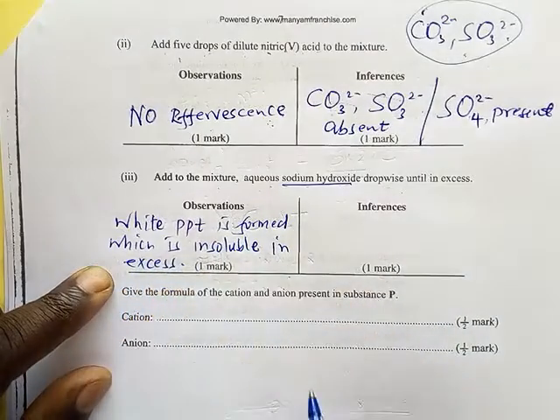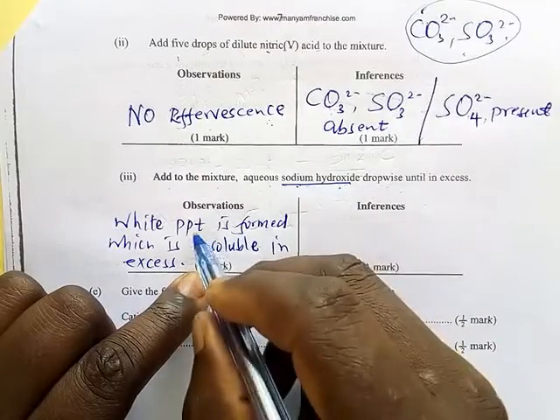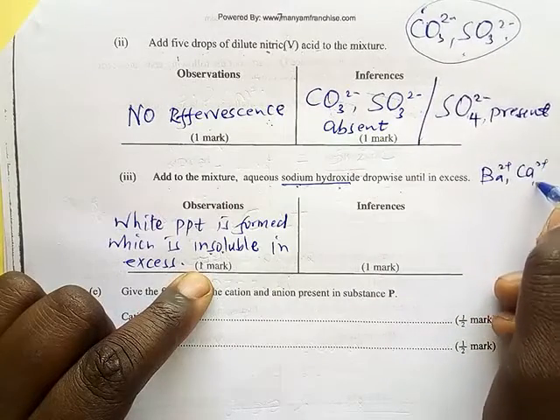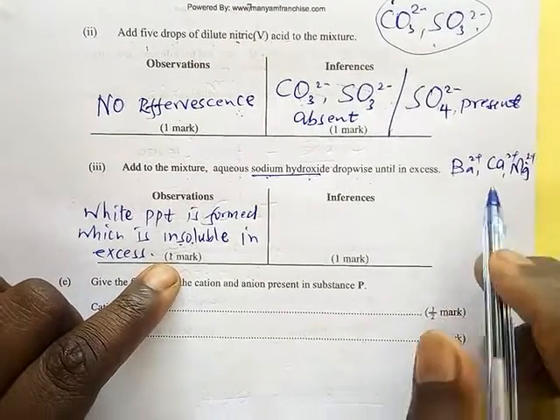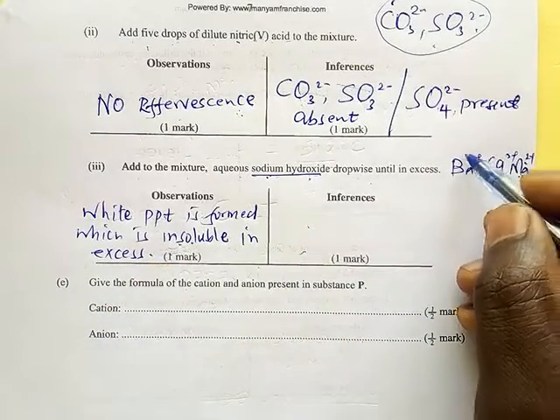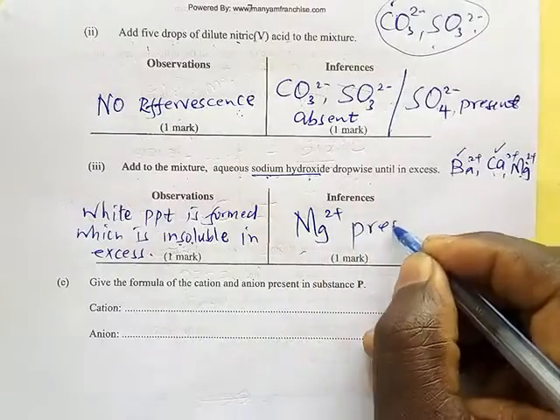So that tells you, when adding sodium hydroxide, a white precipitate is formed insoluble, then we know for sure that barium 2 positive, calcium 2 positive, and magnesium 2 positive are there. But now this is our last test. We are going to ignore the barium and the calcium, and then we are going to take the magnesium 2 positive as present.